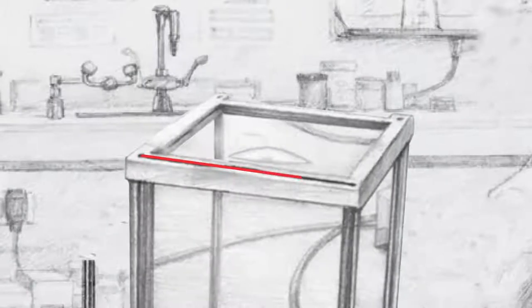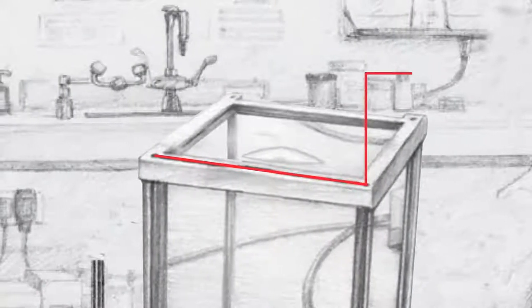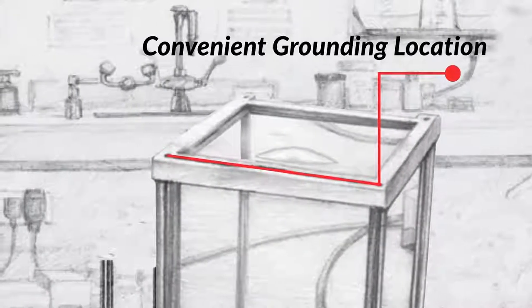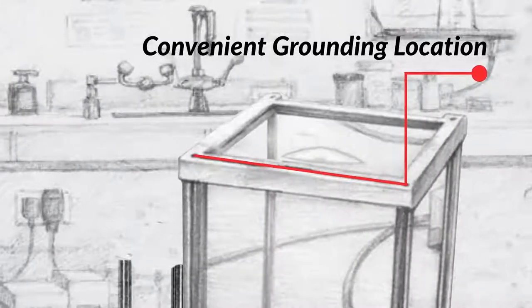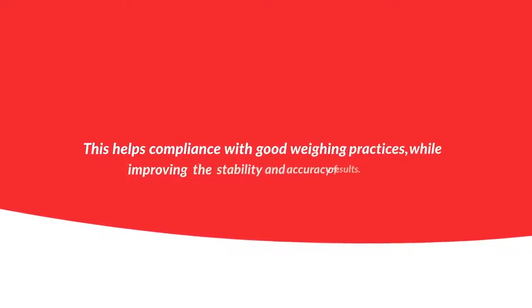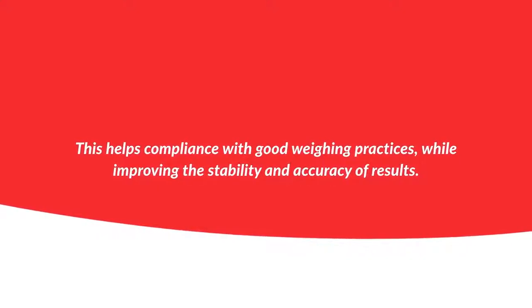A static removal bar along the top of the draft shield provides a convenient grounding location, allowing the user to discharge any static charge that may have accumulated prior to handling samples and weighing. This helps compliance with good weighing practices, while improving the stability and accuracy of results.